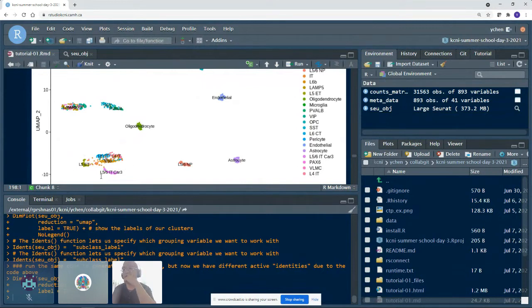These are excitatory neurons. So they are also very close to each other, but now we see these groups being perhaps a bit less well defined. So you see, for example, blue cells mixed with these orange cells. And we see this with these inhibitory neurons as well.